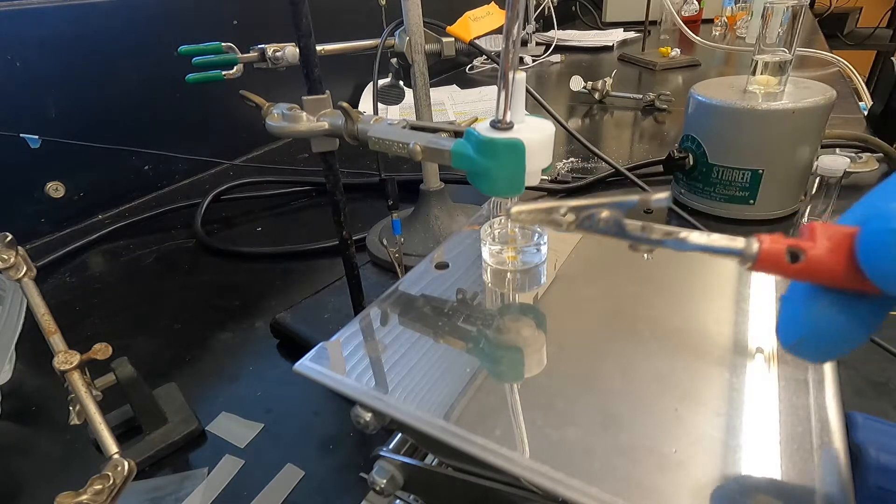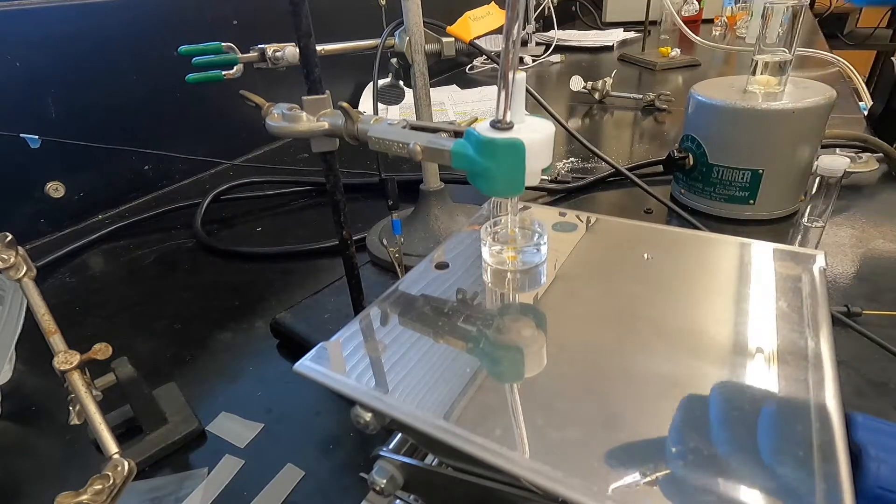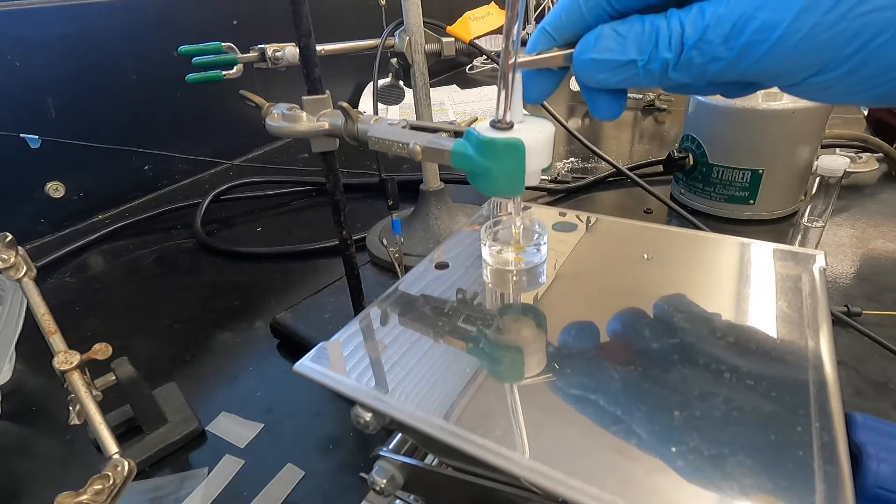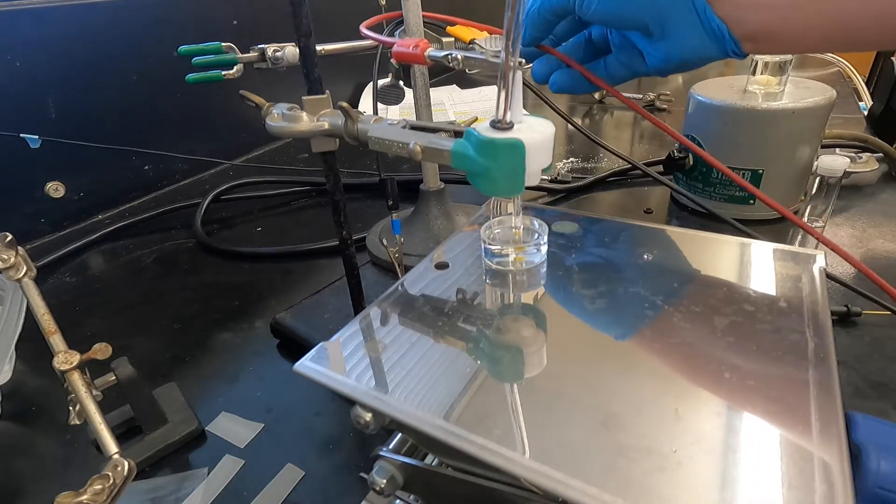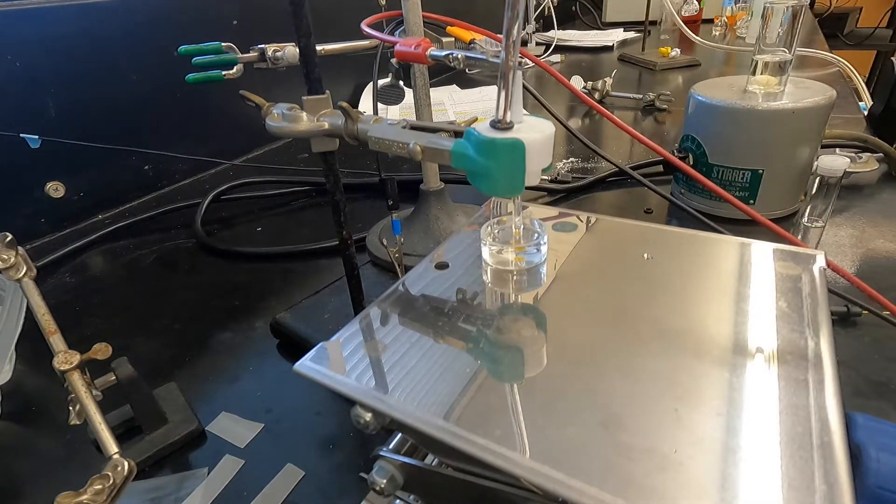You're going to hook up the working and working sense electrodes to your reference electrode and then loop that out of the way so it doesn't touch the counter electrode.